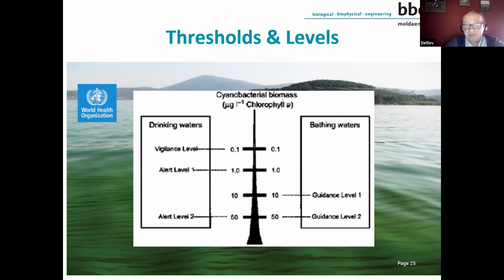I would say these are some numbers which can help you to have an idea what has to be done when you find levels. And many of the organizations use such numbers to, let's say, stop tourism, for example, or set warning notes not to enter for bathing. So these numbers might be helpful, but the responsibility depends on the different organizations. As you know, in the US there are many which provide you with such warning notes from time to time.